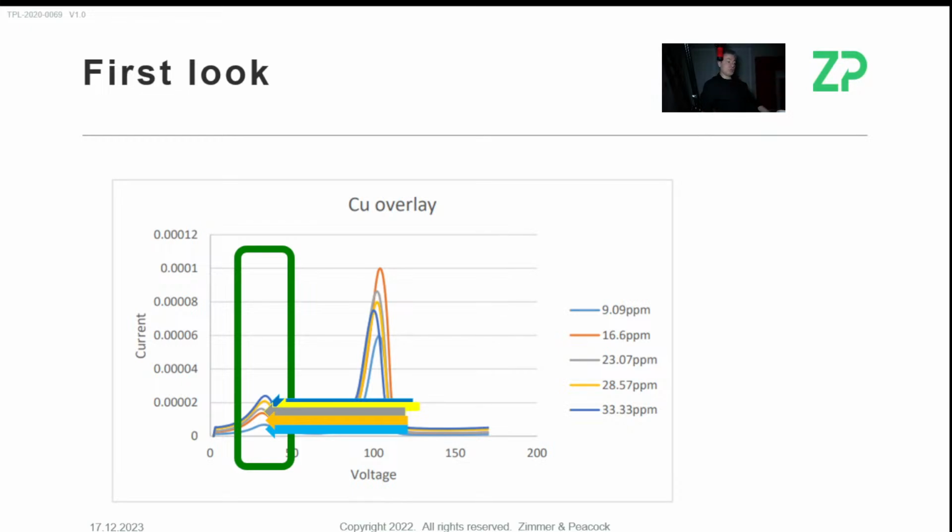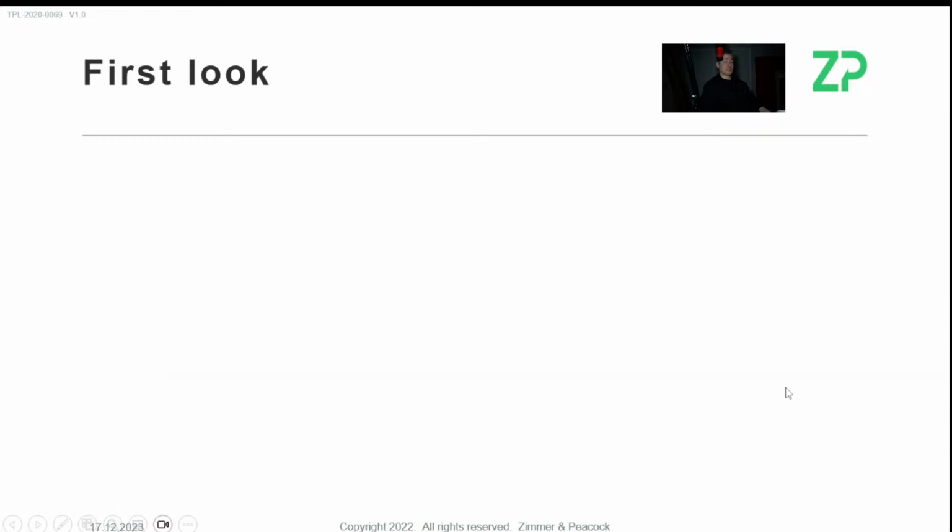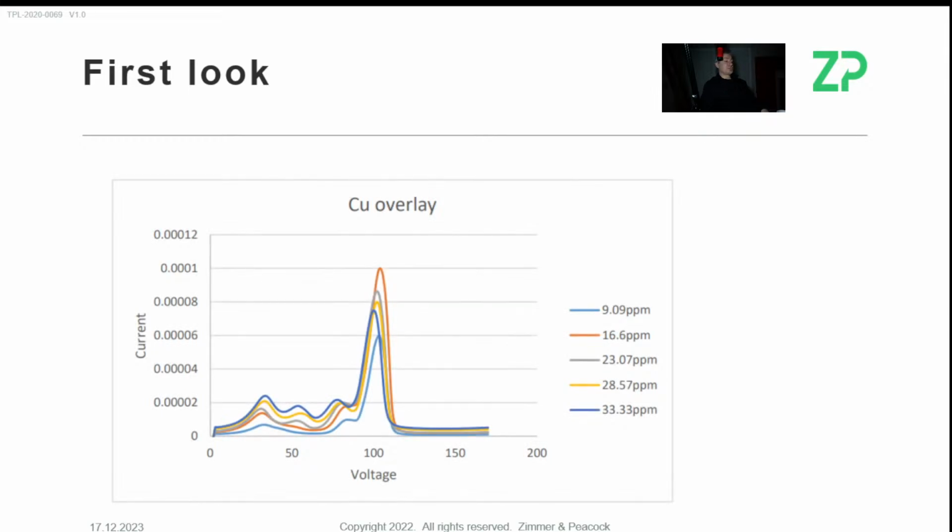But I do understand that you want to understand a little bit more about what's actually happening here, so I'll give you my pragmatic opinion, but now I'll also dig into it a little bit more. It's interesting to see that this relationship between lowest to highest concentration is also preserved in peak 2. So peak 1 and peak 2 are telling me that signal tracks copper concentration. When we go to peak 3, I should label these up, but I'll call this peak 3 here.